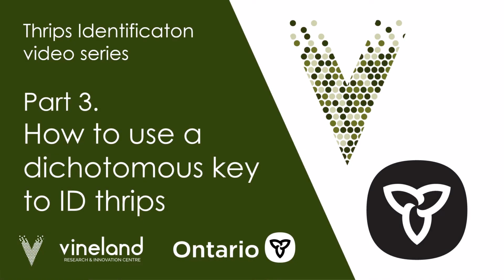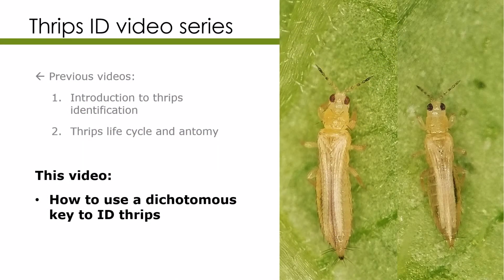Welcome to the third installment of our Thrips Identification video series. In this video, we'll take a closer look at identification features and walk through how to identify thrips using a dichotomous key.